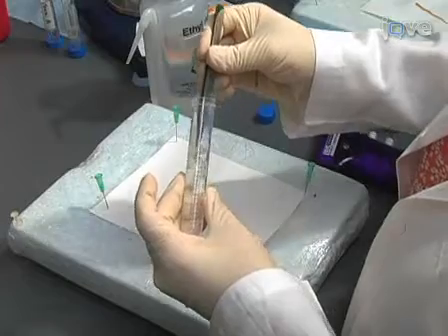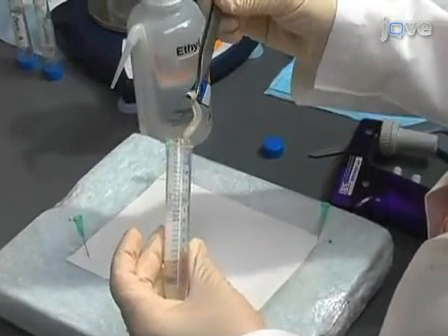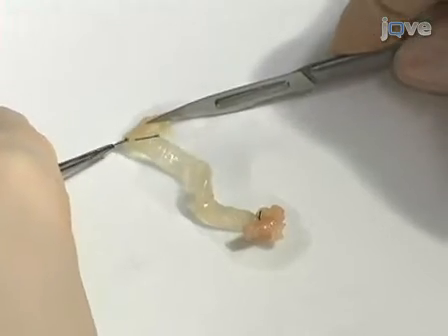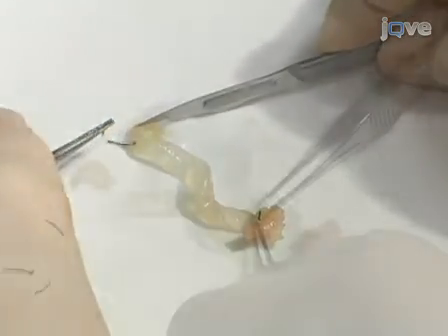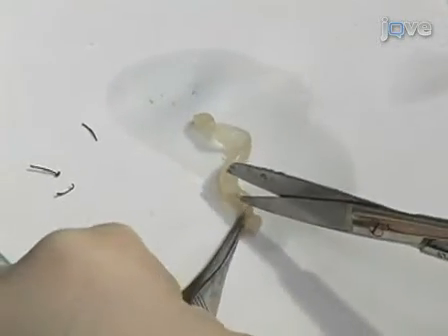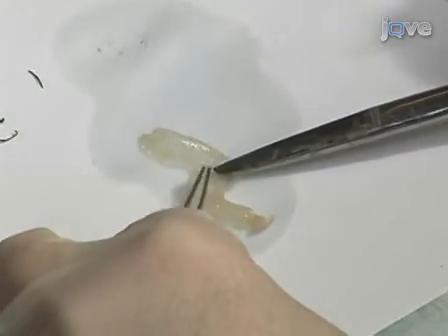When you are ready to analyze the colon, remove it from the conical tube. Cut the strings on each end with a scalpel, being careful not to damage the colon. Remember that the distal end has the longest piece of string. Cut the colon longitudinally from the distal to proximal end so that it forms a long sheet. The colon can now be viewed under a dissecting microscope.